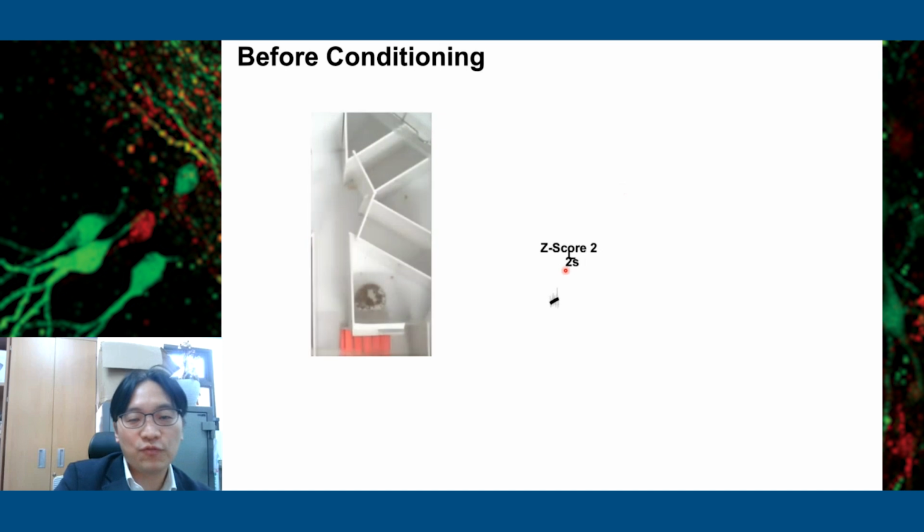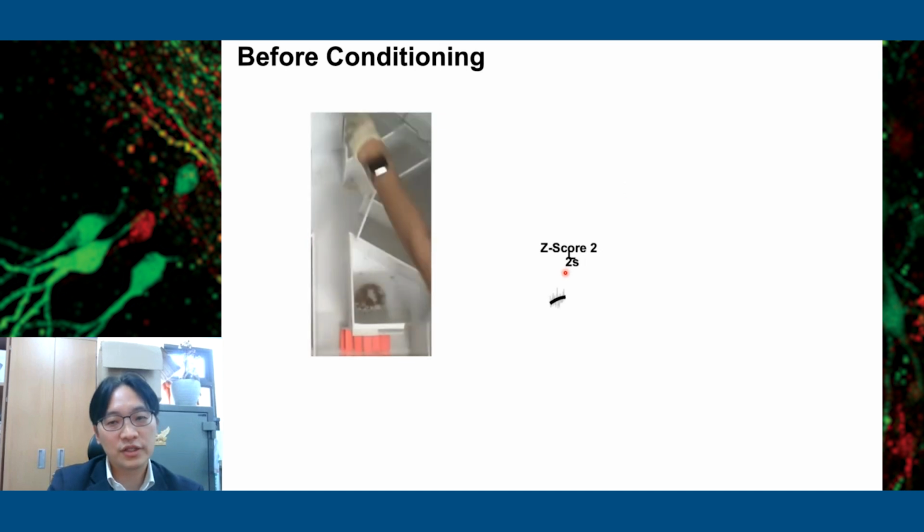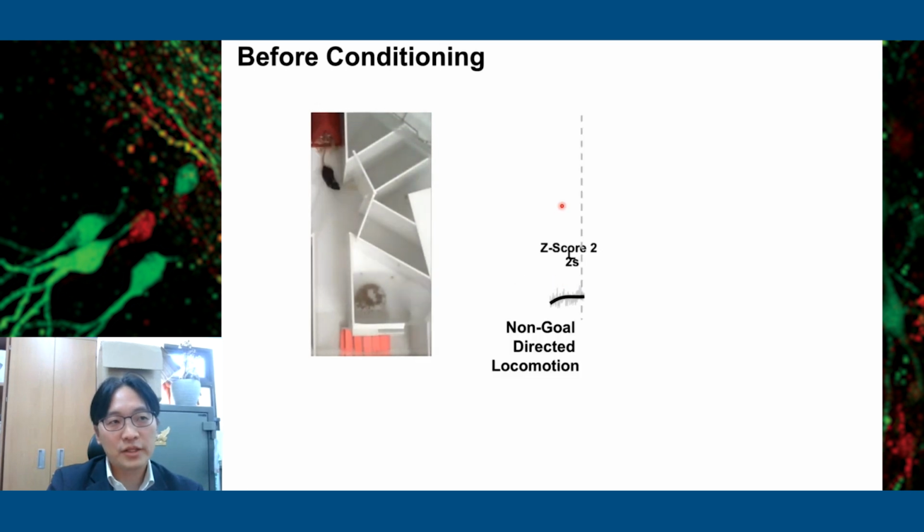So we can show the subpopulation by using this miniscope. And this is photometry data that suggests that we can have this analysis. So this mouse is going to eat its food reward at the end of this maze. This is the first time the mouse is moving toward the food. So we are recording the lateral hypothalamus leptin receptor neurons, the bulk neurons, this time with photometry.